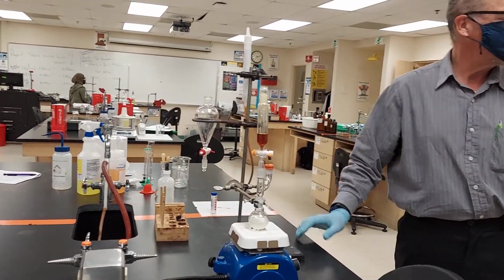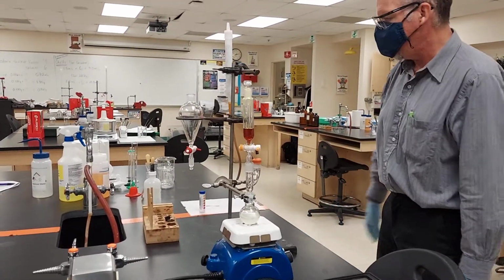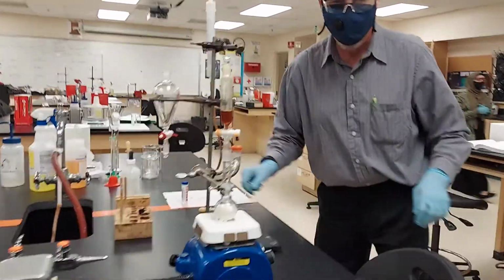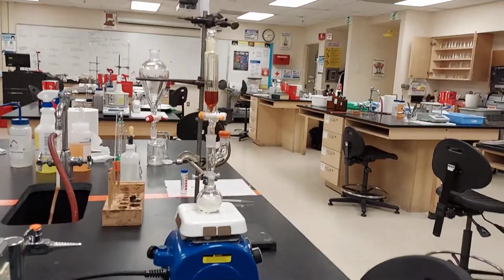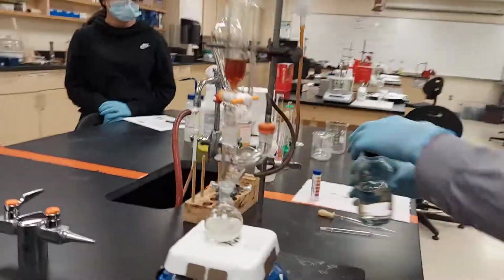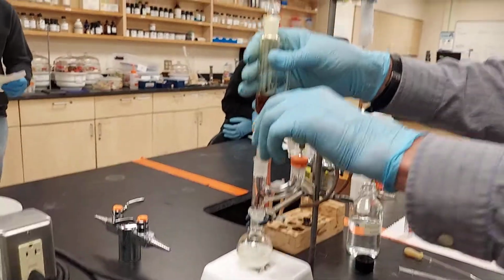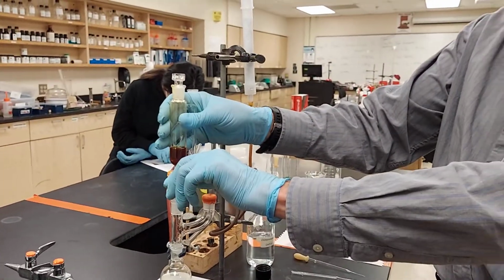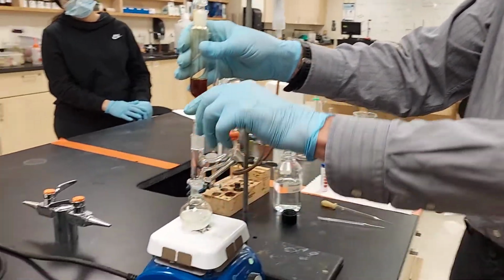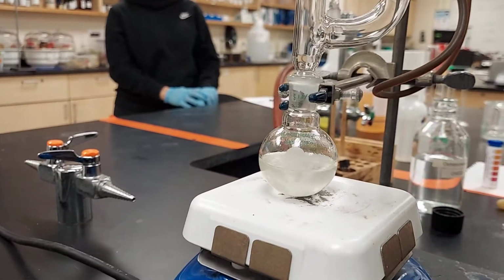And what do we do now? We need to add the methylene chloride ferrocene mixture. I'm getting ahead. It says to add it slowly. That's a nice thing about our pressure equalized dropping funnel. And watch the color change after we start adding the reagent. You're going to like it, I'm pretty sure.